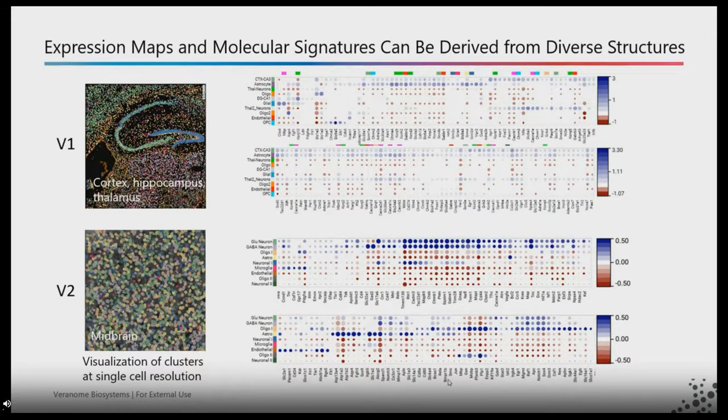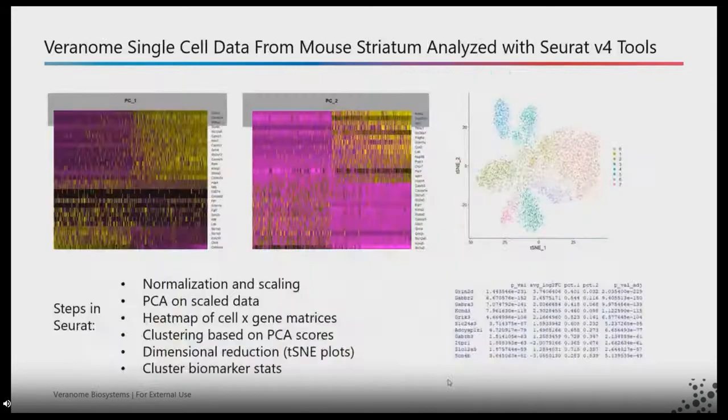You're looking at the Z-scores as well on the bar on the right. You've got Z-scores distributed from negative to positive, and you can see cluster representation and the variance that helps define those clusters using that Z-score information. All that information can be downloaded into Excel spreadsheets if need be, or put into other programs. So the export of Veranome data is quite simple.